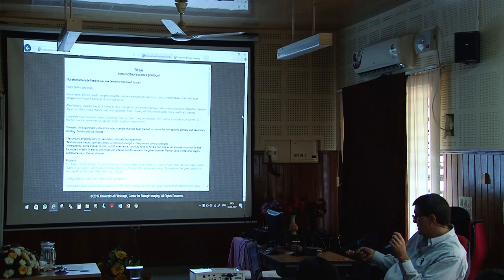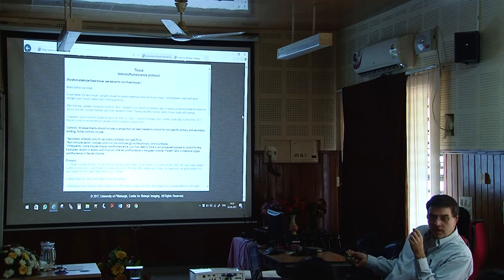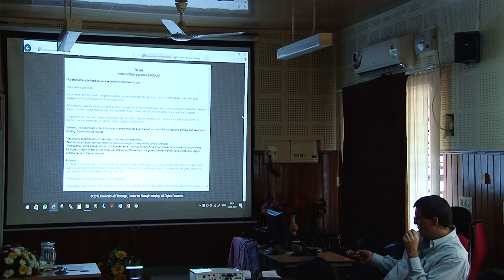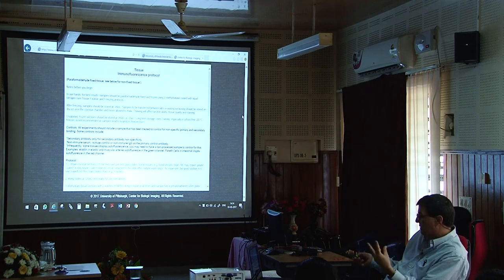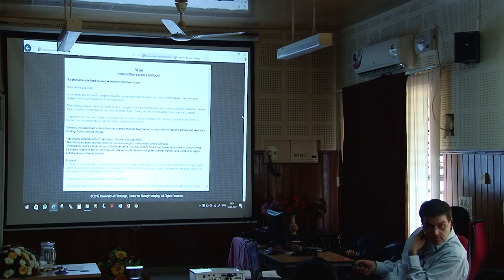Okay, again, same idea. Even though it's tissue, you have the same idea of controls. Tissue tends to impart more autofluorescence. I work with retina. Retina's pretty bad. It autofluoresces quite a bit. But in general, tissue will autofluoresce more than cells, so you definitely want to do this autofluorescent control, I would think, for tissue, okay?